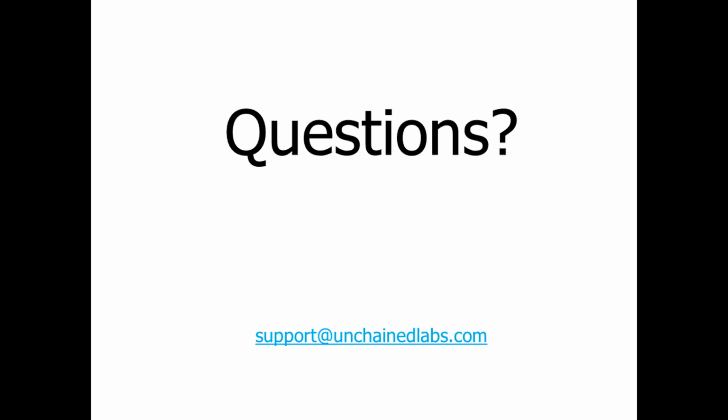Thank you. And we do have a few questions that have come in. The first question is, how does LEA 9 impact data analysis add-ins?